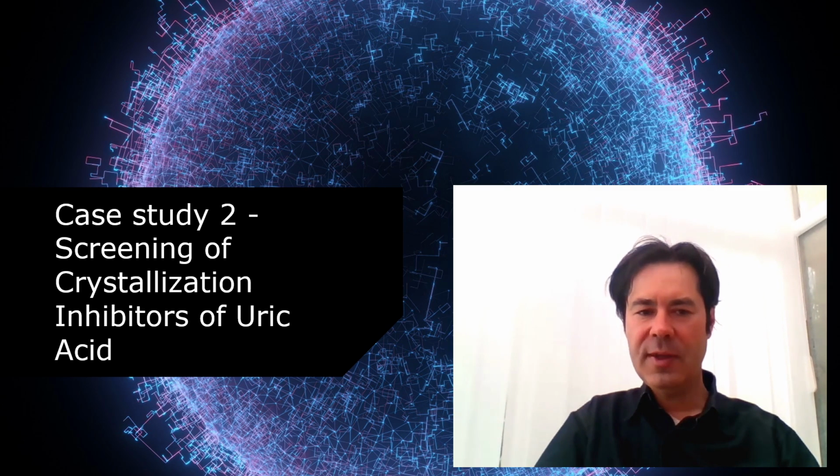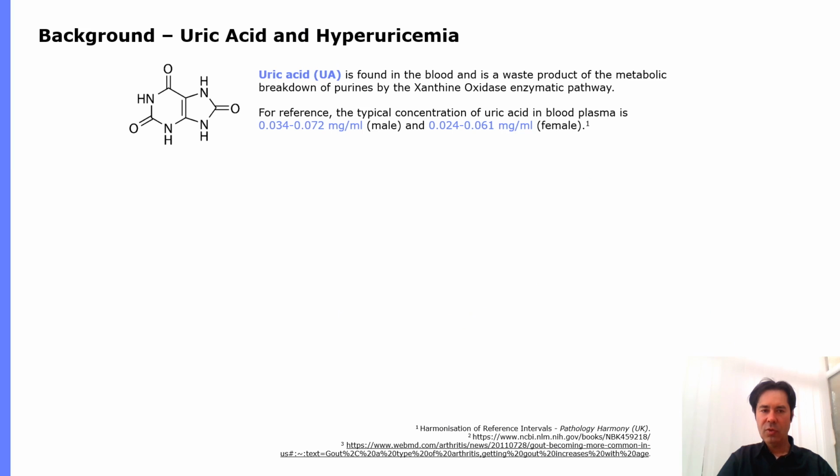So the second study is a less conventional way in the use of the Crystal16, and the title is Screening of Crystallization Inhibitors of Uric Acid. So first of all, I'm going to give you some background on uric acid and hyperuricemia.